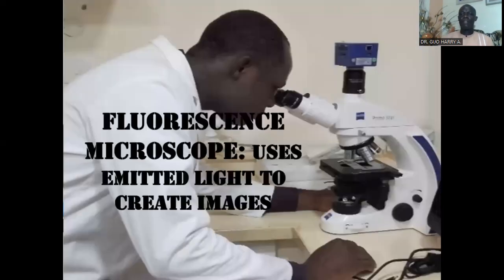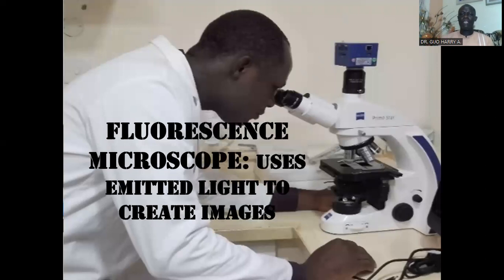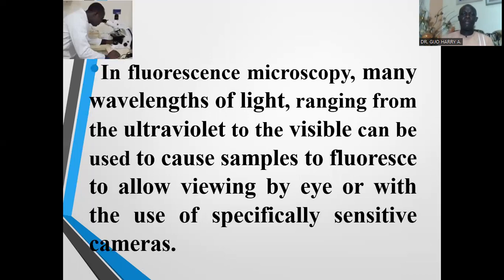Now, having discussed the confocal laser scanning microscope, we want to look at the fluorescent microscope. The fluorescent microscope uses emitted light to create images. In a fluorescent microscope, many wavelengths of light ranging from the ultraviolet to the visible can be used to cause samples to fluoresce, to allow viewing by eye or with the use of specifically sensitive cameras.